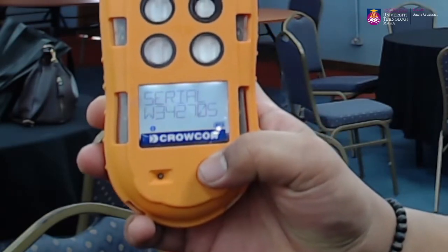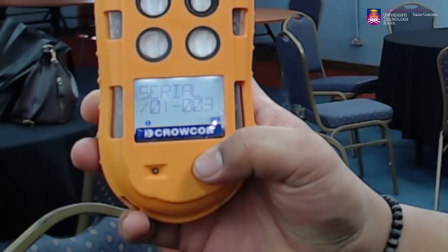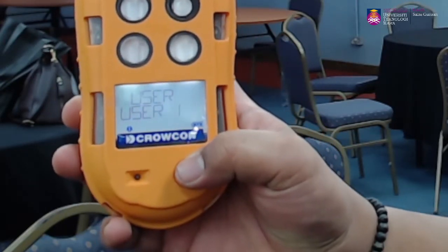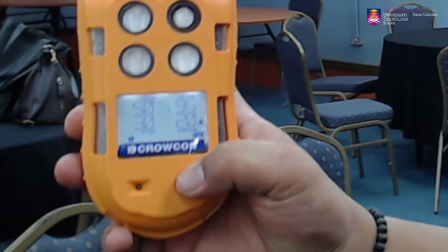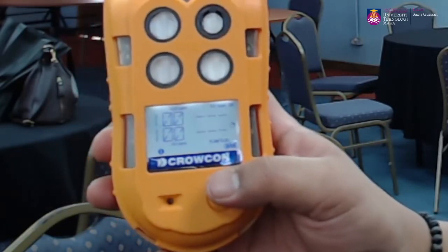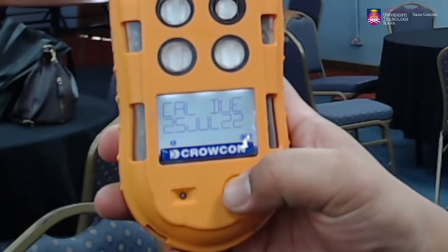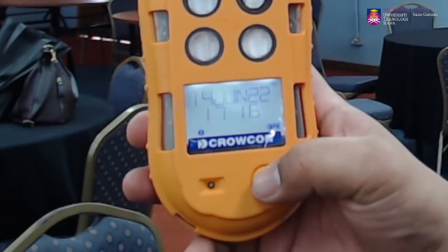It will show our serial number from the startup, and also our firmware version. Then for the user, we can see User 1, who is using it. Currently it is showing the current readings, and the information, including cal due, how long is left.